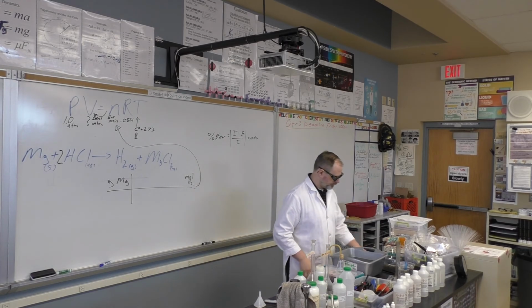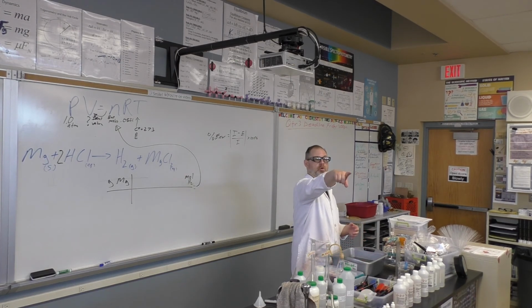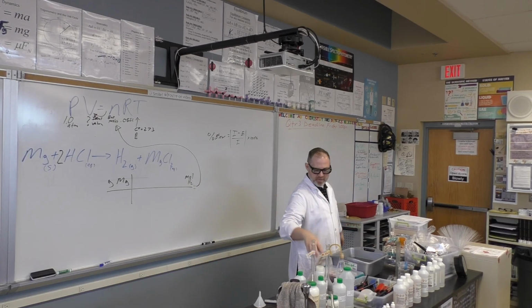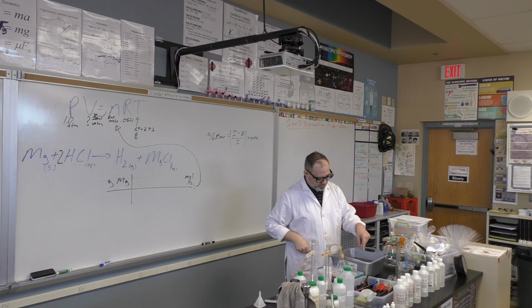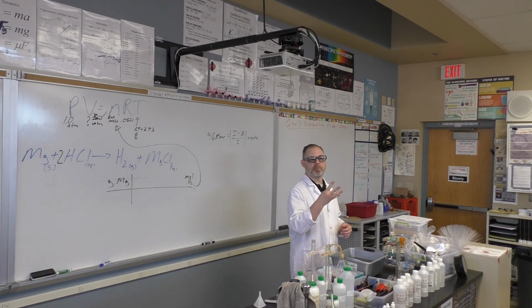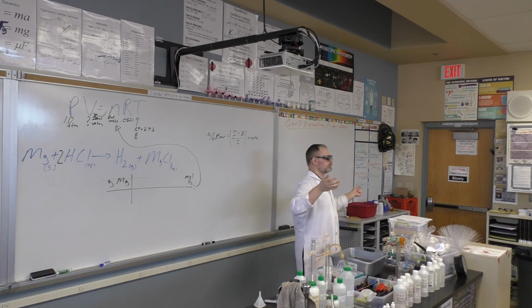From the top. You're going to need your water bath, your gas collection tube, and an Erlenmeyer flask, which are over there in the cabinet. Graduated cylinders are right there, acids are right here. If these run out, let me know. I've intentionally let them run low in volume. Put a thermometer in the water bath, then you're going to need 4 pieces of magnesium between 0.08 and 0.12 grams. And those are right there.